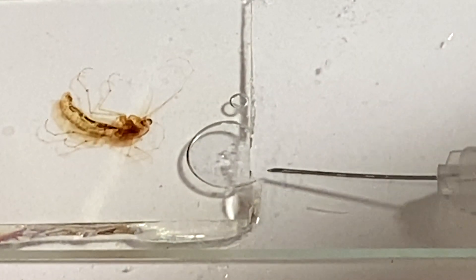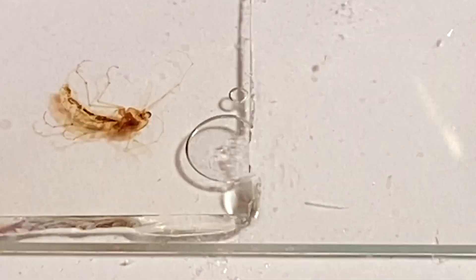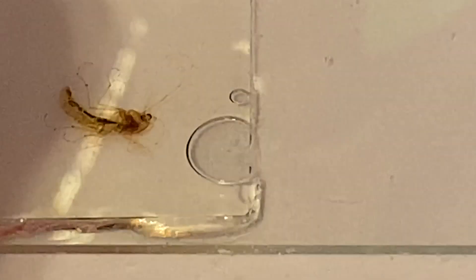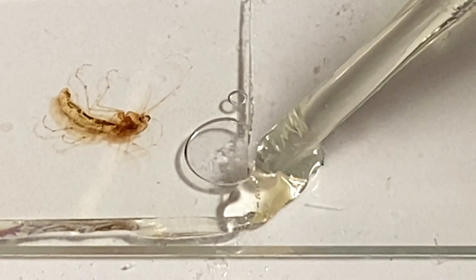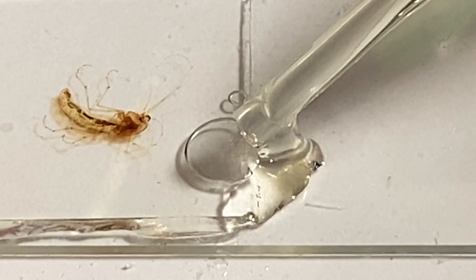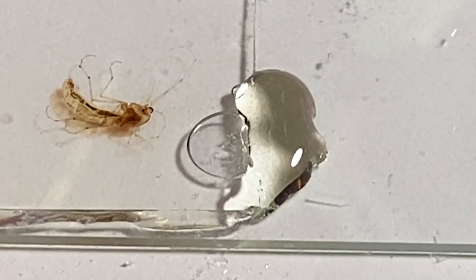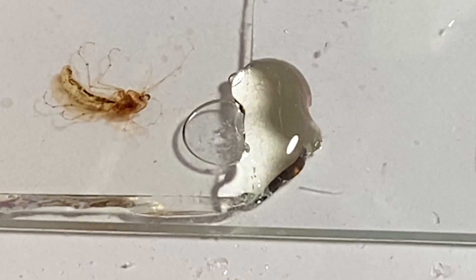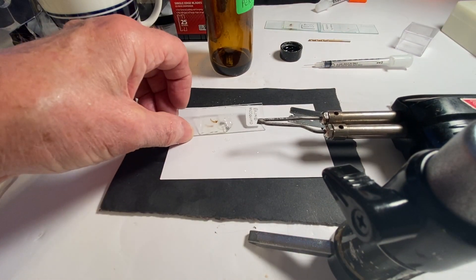I can get the needle underneath now, but you have to be very careful because you can break that coverslip before you even know it. The next thing we're going to do is lay a bead of mounting medium along here on the outside. You don't always have to do this, but I like to do it because I've found that if I don't, sometimes the bubble disappears and sometimes it doesn't.